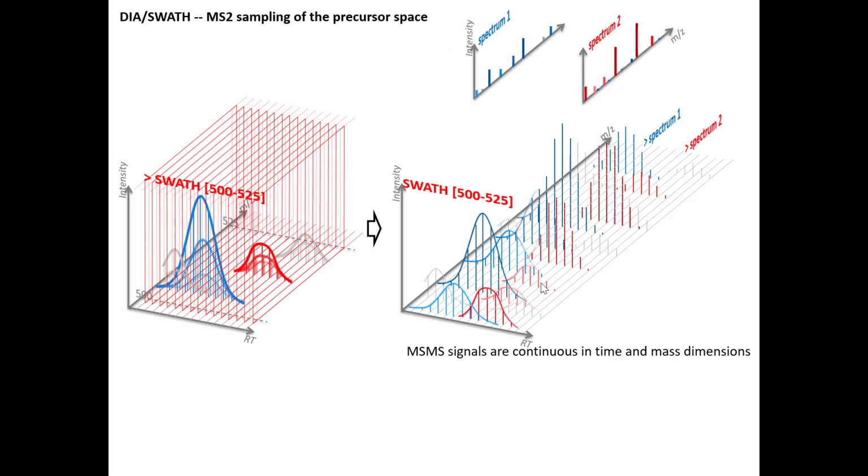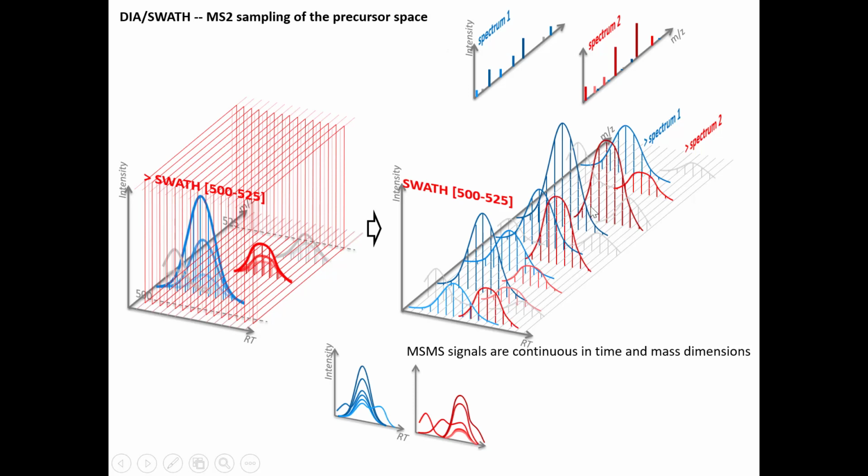And so you can see that in these blue and red peptides, this information is contained in there, but it's in the background of a whole bunch of other things. However, if you introduce some prior knowledge, you say, I already know something about what this blue peptide looks like to the mass spectrometer, I know what the most intense fragment ions are going to be for this blue peptide, then I can selectively extract that information out of these very, very complex MS2 spectra. And if you do that selective extraction, what you finally get back to is a signal which looks, in the end, actually very much like SRM data. And you're going to see this tomorrow yourself in Skyline.